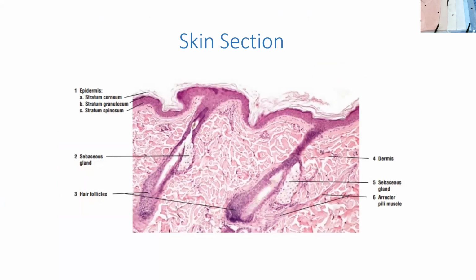Now, a couple more things and we'll wrap this up, and we will weigh the cells in the beaker.